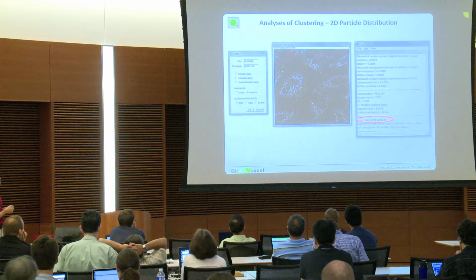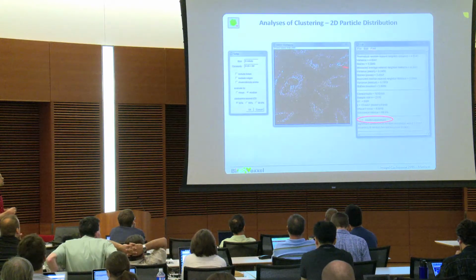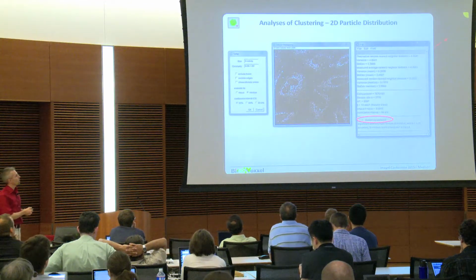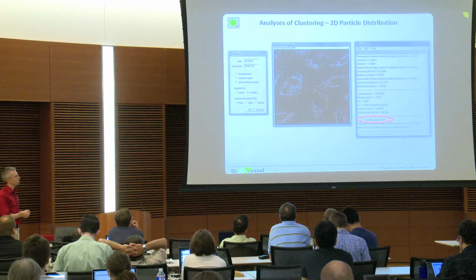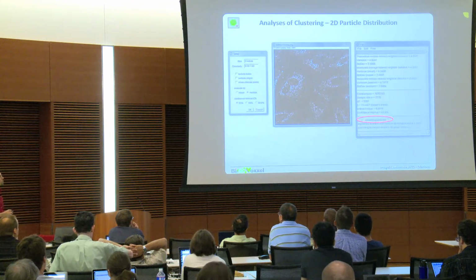And according to that, the analysis of the particles is run. There is the estimated distance between the particles which should be there and the one we measure, and according to that they are compared, and according to that it will tell you you have clustered particles with a certain p-value according to the choice of your confidence interval.